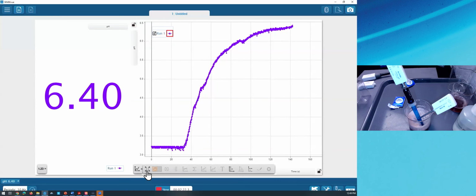Jackie and Chantel, yep, notice that it is indeed making it less acidic. Going toward neutralization here, it looks like 6.4. pH is definitely increasing. So let's let that level off for a moment. And then what are some questions we might want to ask about the data that we see in the graph?